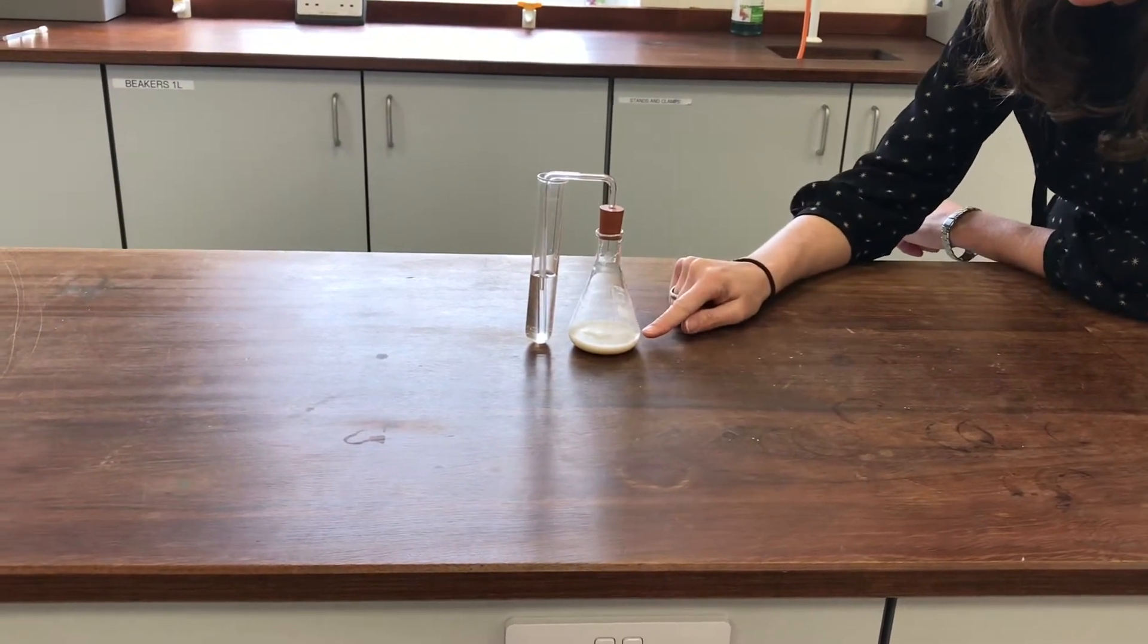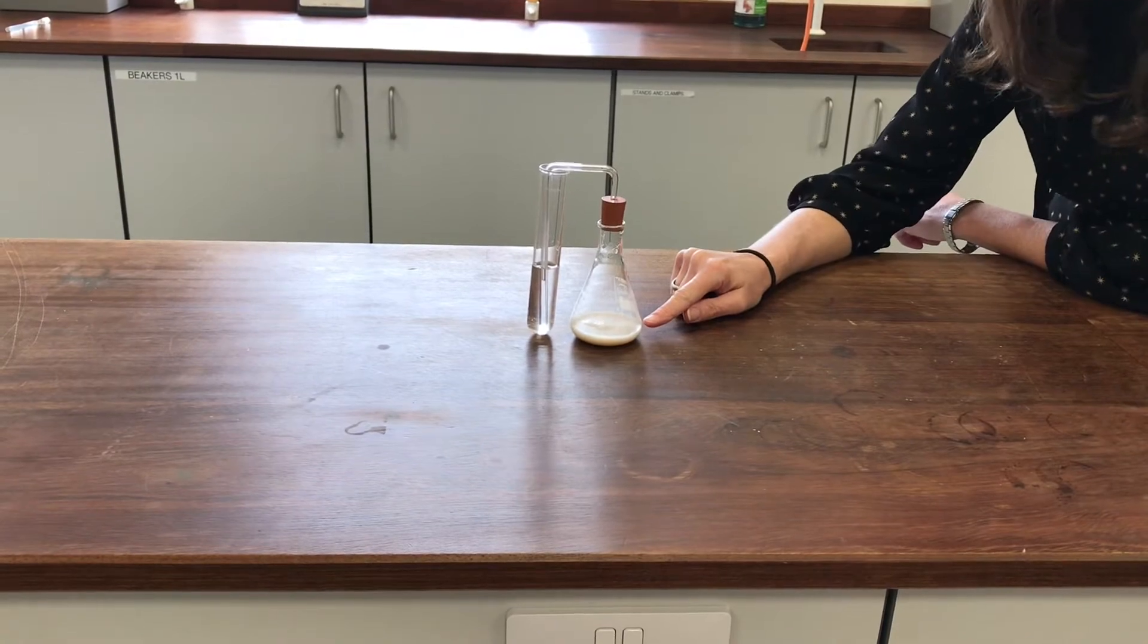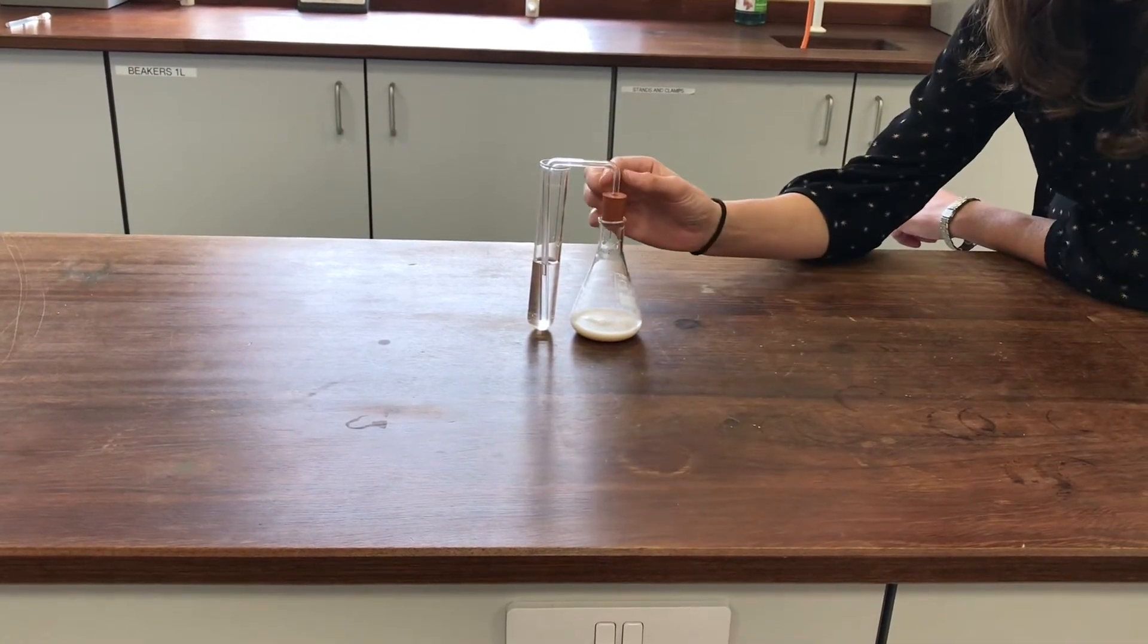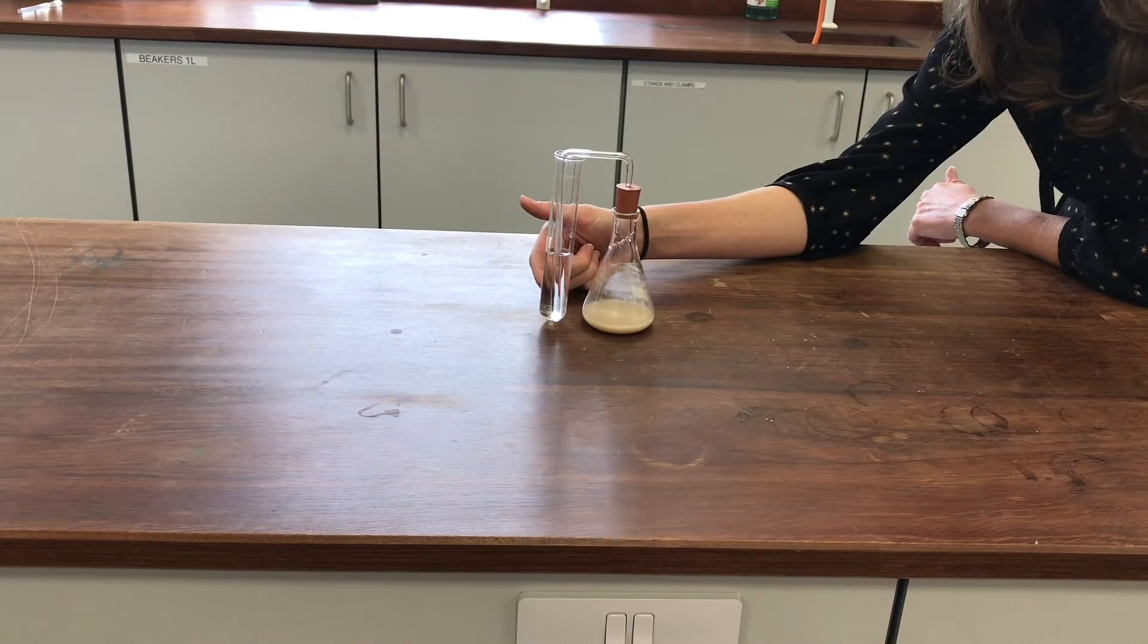In the conical flask at the bottom here, I've got a solution of sugar and I've put some yeast in it as well. And you can see there's a bung in it with a delivery tube and this is going into some lime water here.